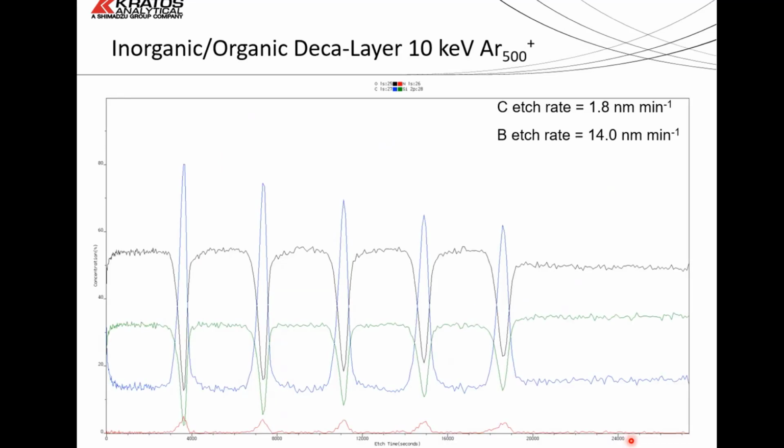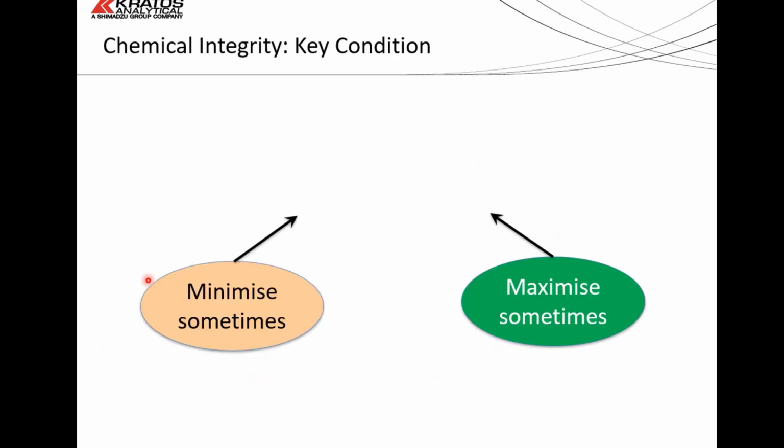Instead of these evenly shaped layers, we see in our depth profile that it takes much longer. The polymers are now compressed into this tiny little experimental time frame by these sharp peaks, whereas it's taking us about 4,000 seconds to get through each one of those inorganic layers. So it's a good example to show the considerations you need when depth profiling different types of target material.